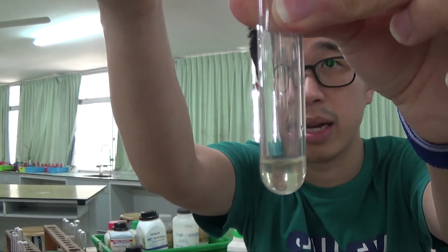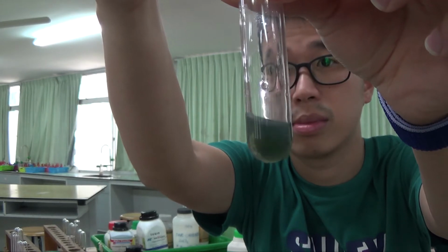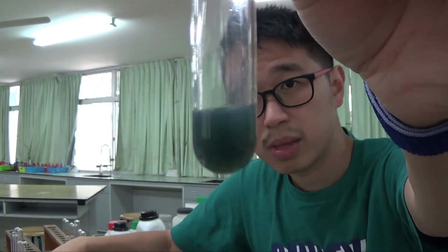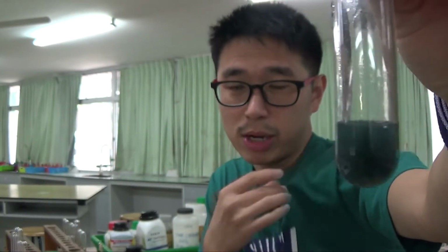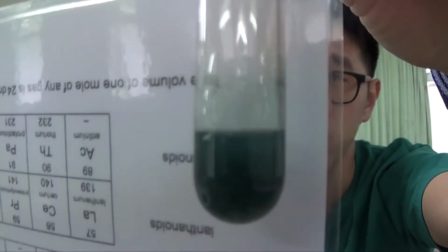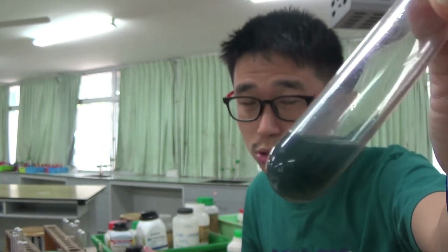This is iron(II) plus in NH3. So you get this precipitate, and this is a precipitate because you cannot see through it at all. This color looks about the same color as my shirt. Actually, it's by coincidence. I think I mentioned in the other video. This is a green precipitate. This is a dirty green precipitate, dirty because it's kind of dark in color. It's very characteristic of iron(II).